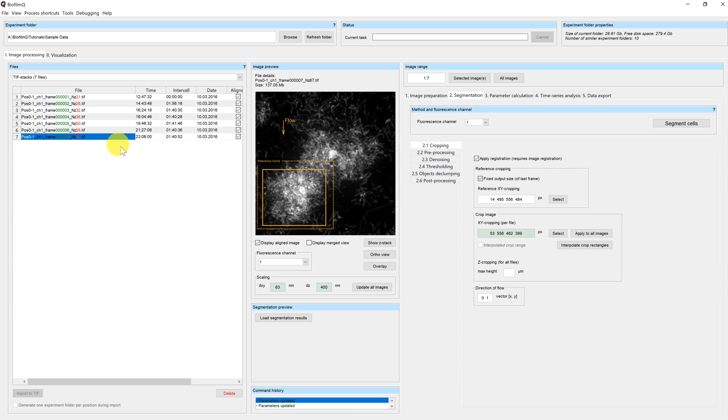There is also an option to apply Z-cropping. This is very useful if your biofilms were smaller in height than you expected and you therefore image too high into the z direction. In such a case, you can easily crop your images by entering the maximal height in micrometers.